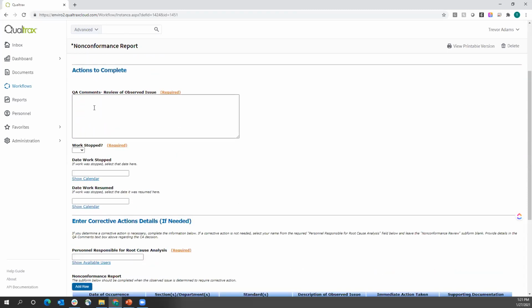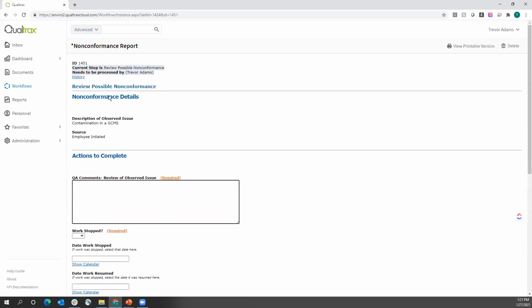And then I have a set of actions to complete as quality manager, right? And what I do depends on a lot of factors, just like you would normally do with any of your quality issues. First, I'm going to provide some comments about what happened.